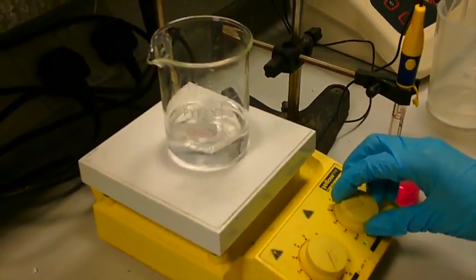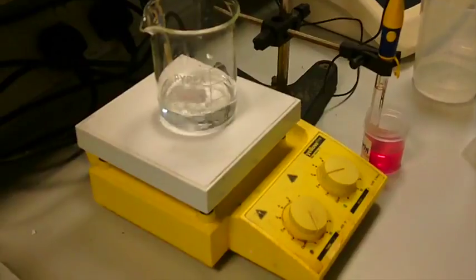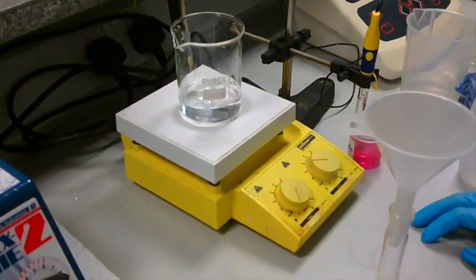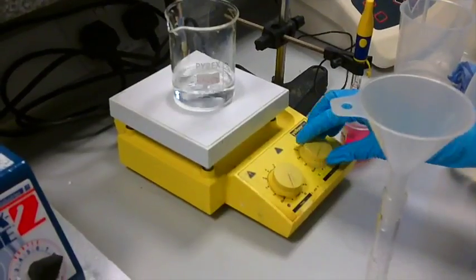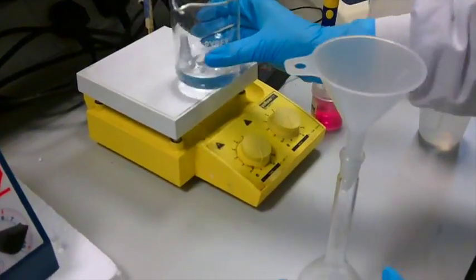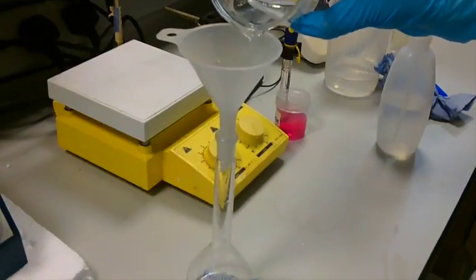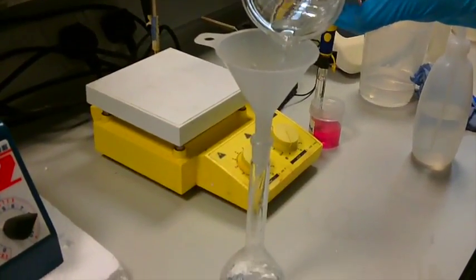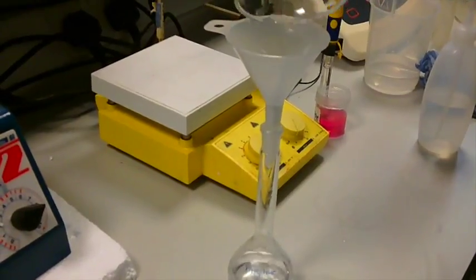After this has been homogenized, you can now pour it into a volumetric flask. Once the solution has been mixed, you can now transfer it to a volumetric flask using a funnel. Once you've added the solution, you can make it up to the mark with water.